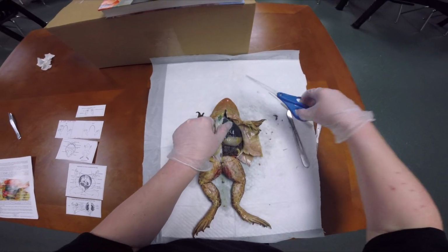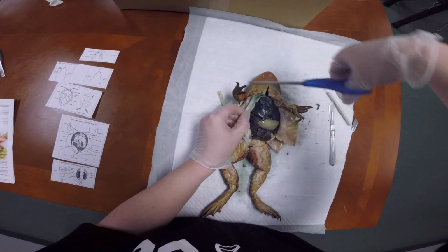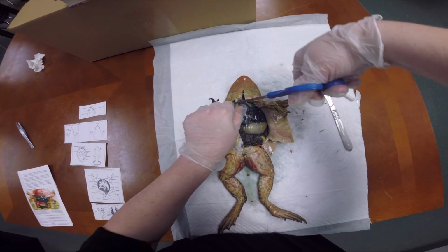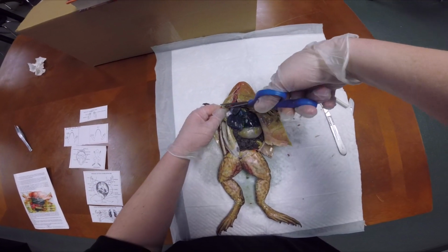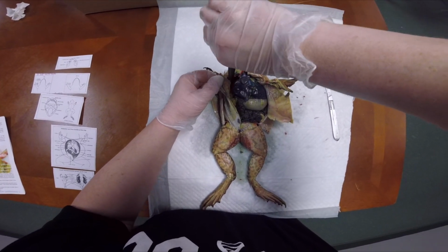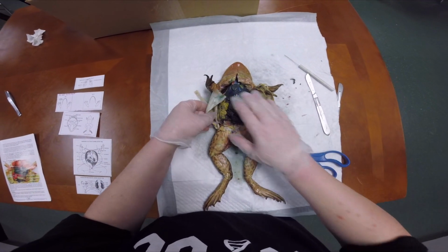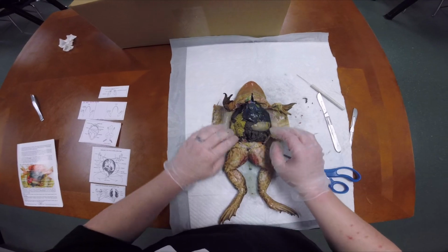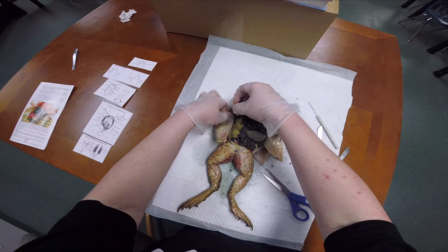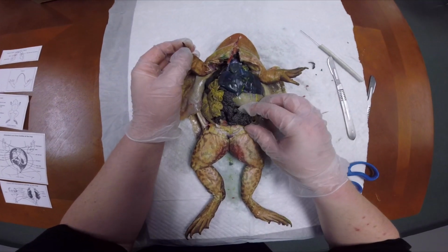Okay, so we got one side open. Let's see about this side. This is the tough side. There we go. Okay, we're getting some progress here. All right, so now we have the muscle wall open. I'm going to tuck that behind the arms, and my hypothesis was correct.